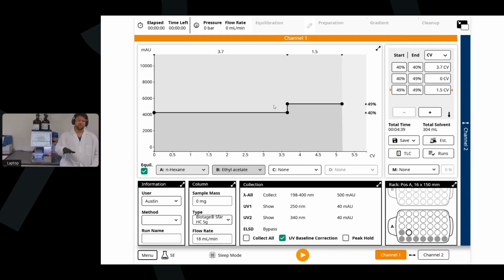I typically max out about 10 before you are probably losing a good bit of chromatographic performance from the column. So from run 1 to run 2, you'll probably see chromatographic resolution drop. So that's why I typically say use the column once and use the next one. But up to you guys to determine what's useful for you and what's not, because I know that is something I get asked a lot.